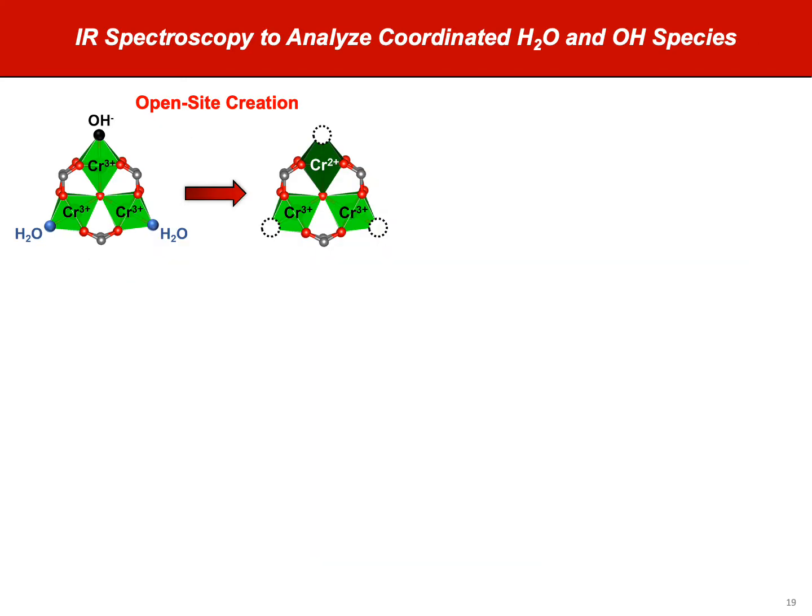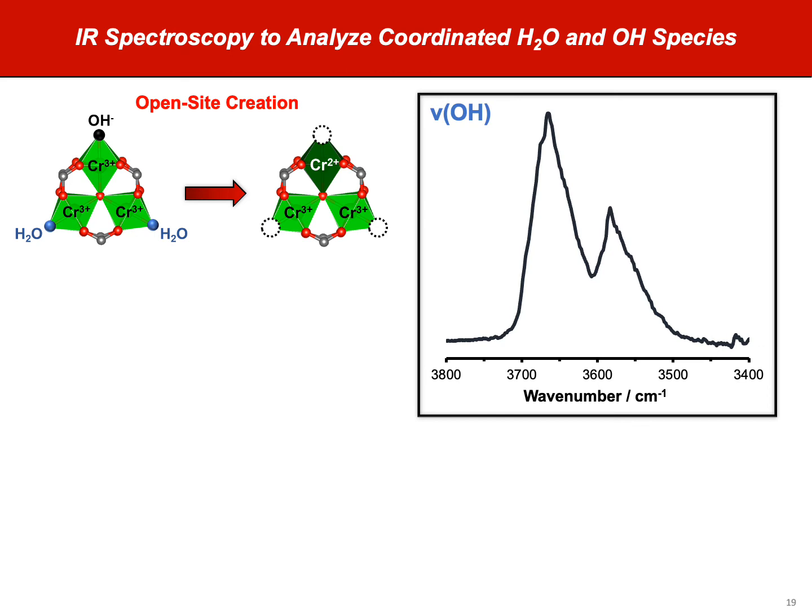To do this, we use infrared spectroscopy, and a key choice that was made in these studies in being able to use infrared spectroscopy for these verifications is the choice of anion. So we intentionally synthesize a material that has a hydroxyl anion as the exclusive anion on this metal organic framework material, rather than using a fluoride anion, which would not allow us to accurately quantify the anion removal using infrared spectroscopy techniques.